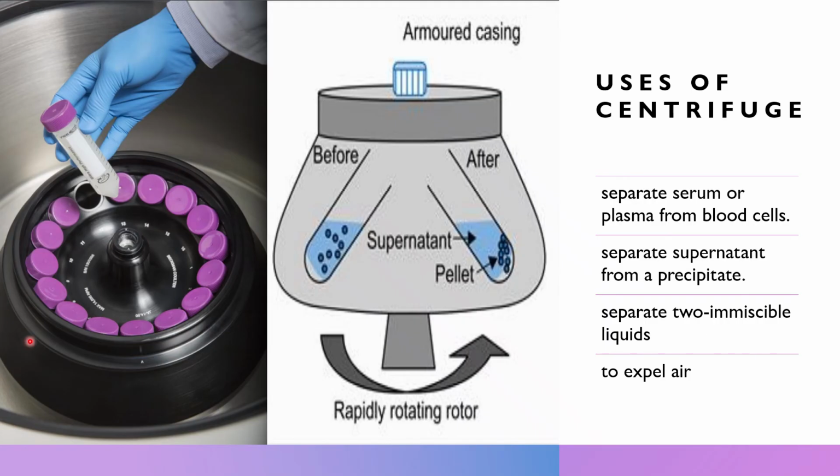This is what a centrifuge would look like. I suppose you already met one or you've seen one in the laboratory. Centrifuge classification is based on several criteria, including benchtop or floor model. If it's a floor model, then that's a big centrifuge. It also depends on refrigeration and rotor head, either fixed, hematocrit type, swinging bucket, or angled.